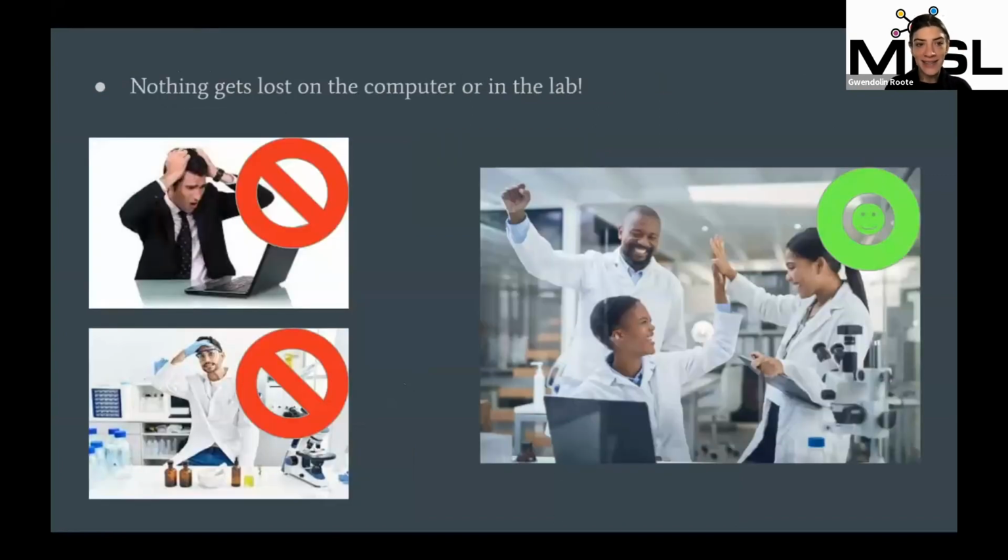And nothing gets lost. No headaches, no researchers crying in the ante room because they can't find the sample that they made last week. We have a great workflow and a great team.